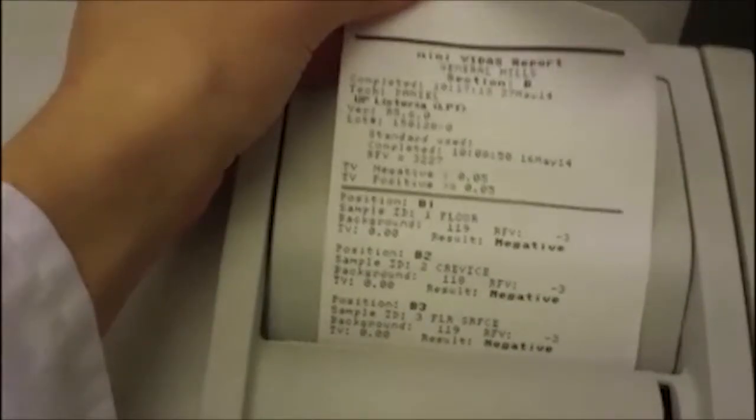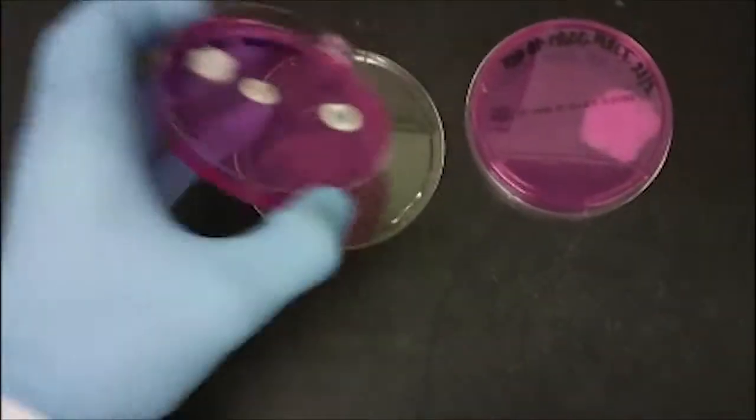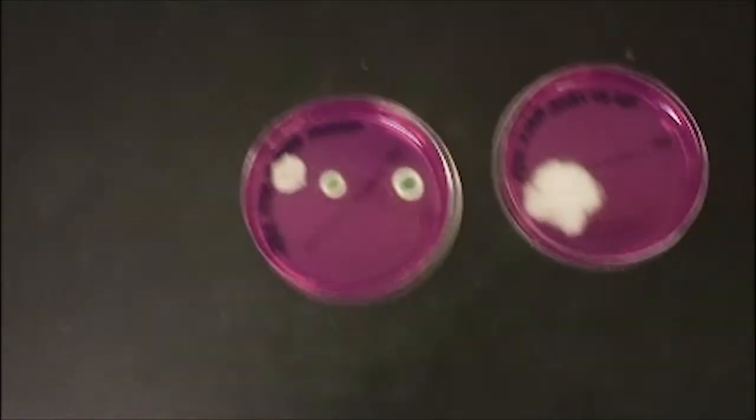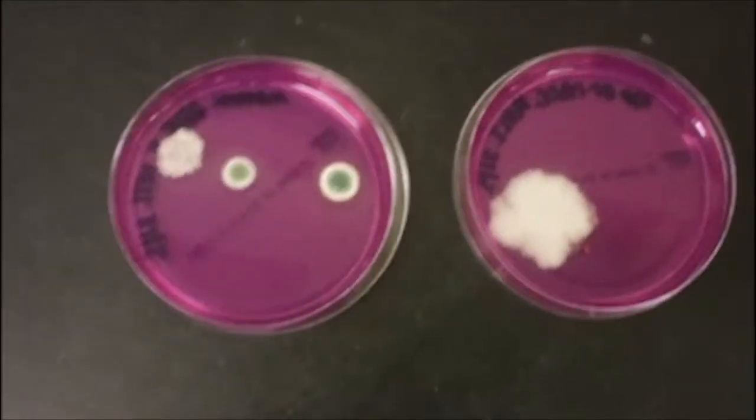After I've done all my Listeria testing, I might do some air sampling for yeasts and molds or I might do some other lab work such as pH and water activity before I leave for uni where my first lecture begins at 12 o'clock.